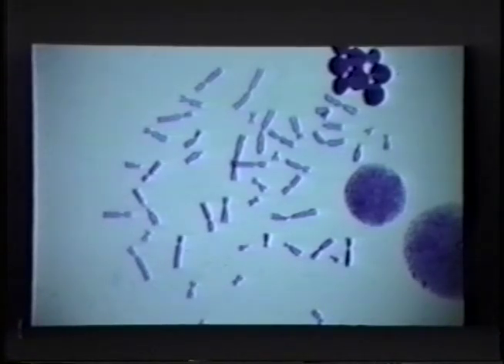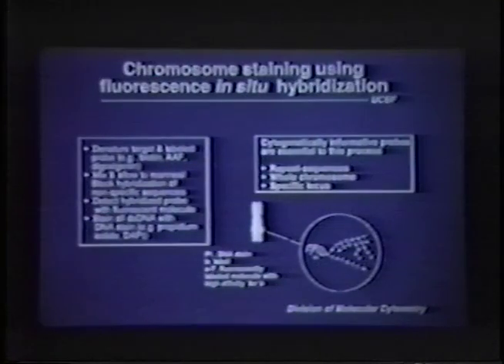Now, I'm not going to talk much about chromosomal organization of the nucleus and the physical mapping because these topics are going to be covered later in this meeting by people like Barb Trask and Jeannie Lawrence. Instead, I'm going to start with a discussion and overview of the technology and then talk about its application in the characterization of several genetic diseases, ranging from things like Down syndrome prenatally to the diagnosis and prognostication in human solid tumors. So let me start with the general technology.